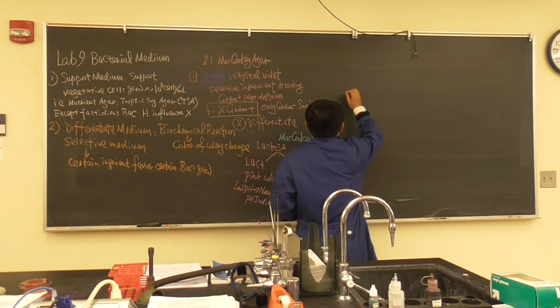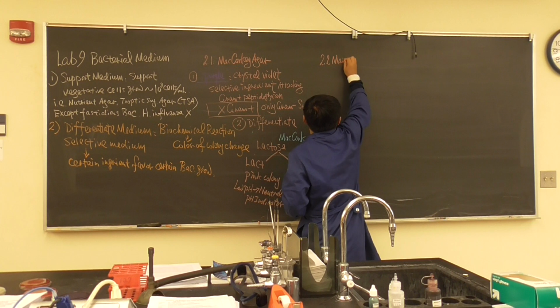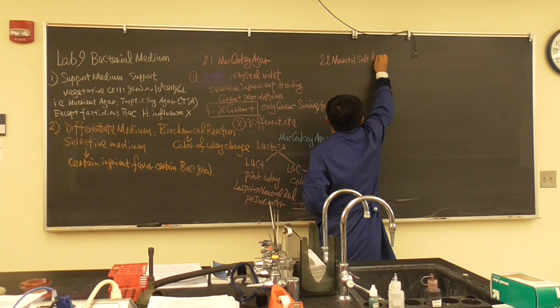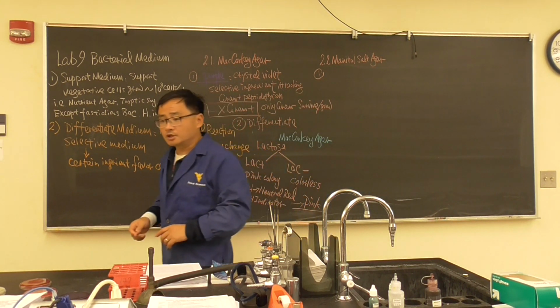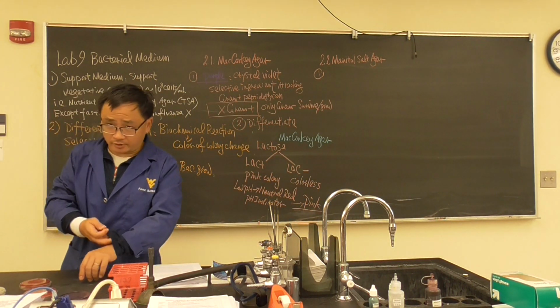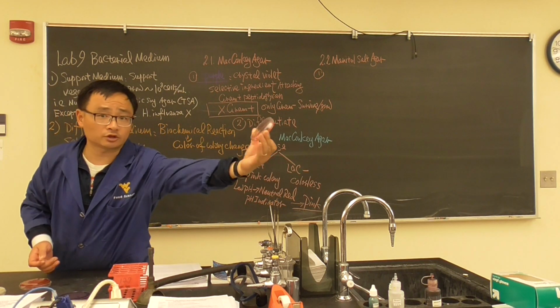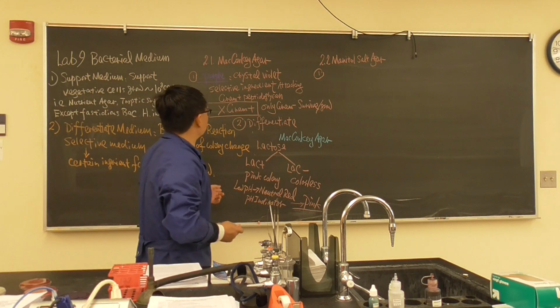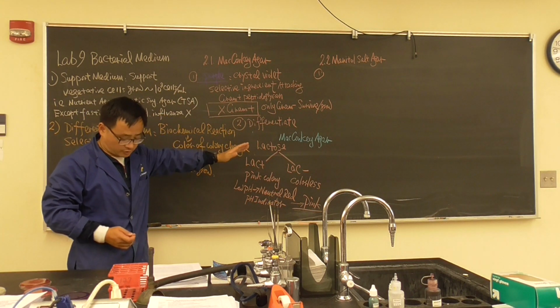Okay, we want to introduce another agar for you. Mannitol salt agar. And this is a question which is in your practice exam of lecture and also in the real exam. And remember the question we changed a little bit. And this is mannitol salt agar. Looks like pink. It is the same as MacConkey agar. It's a selective media and a differentiated media.